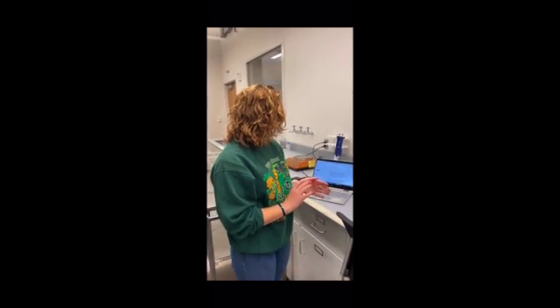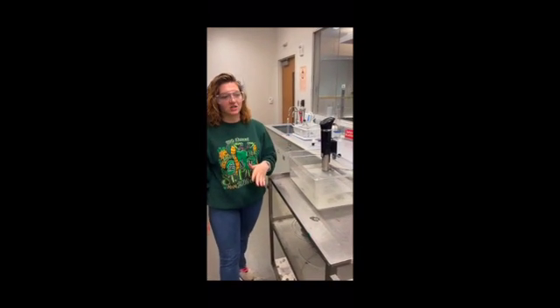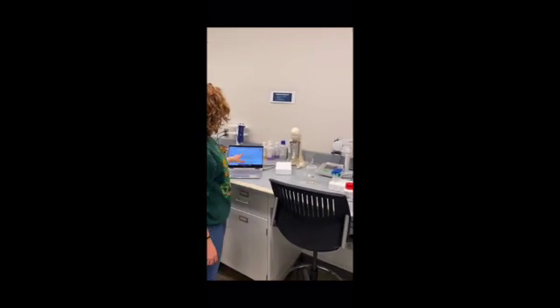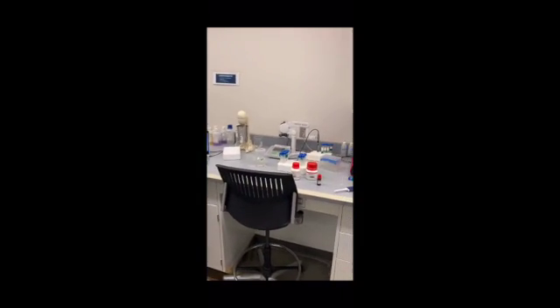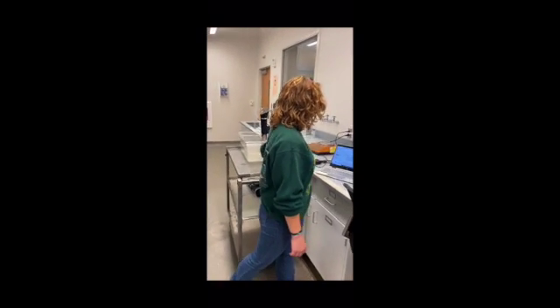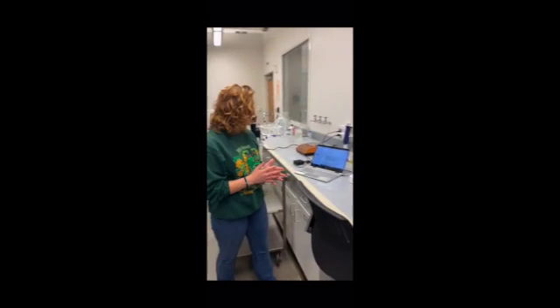After the test tubes were all made, we came over here and we would turn on the hot water bath, which Ashton will explain a bit more in his section of the equipment. After the hot water bath was turned on, we heated it up first to 32 degrees Celsius, and then placed 2 sets of the solutions, so the test tubes, along the walls of the hot water bath and allowed that to heat up, along with some of the enzyme dilution, so that way it also was heated up with the rest of the solutions.